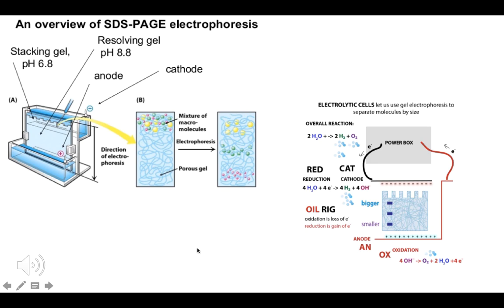We're talking about electrophoresis. So we have 2 types of electrophoresis: native gel electrophoresis and SDS-PAGE gel electrophoresis. Electrophoresis is a method of separating proteins and nucleotides by their size. Samples are placed in wells, and for agarose native gel electrophoresis, they create an electric field. They go towards the anode via electric current, so smaller fragments travel farther than the larger fragments due to frictional forces.